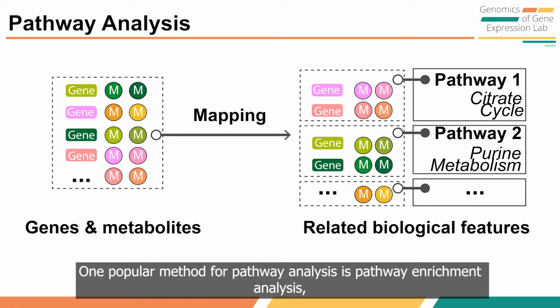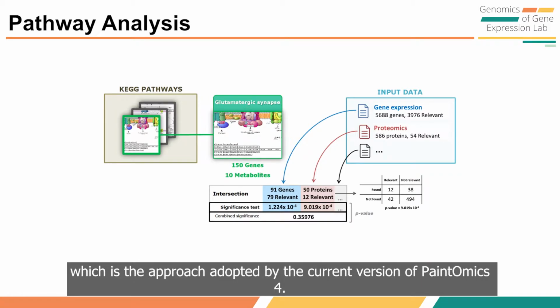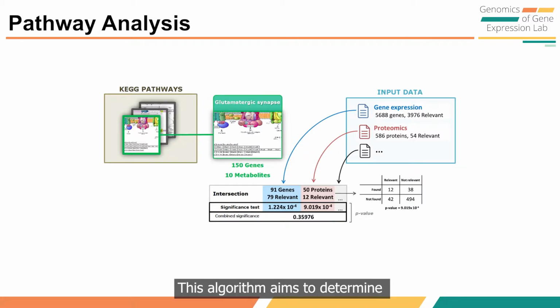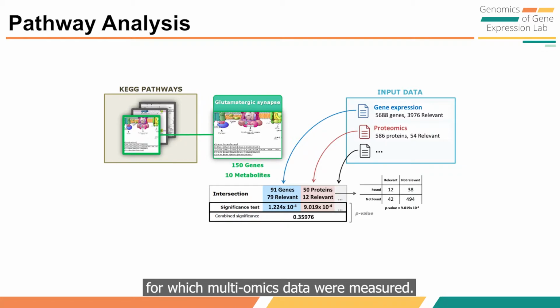One popular method for pathway analysis is pathway enrichment analysis, which is the approach adopted by the current version of PaintOmics 4.